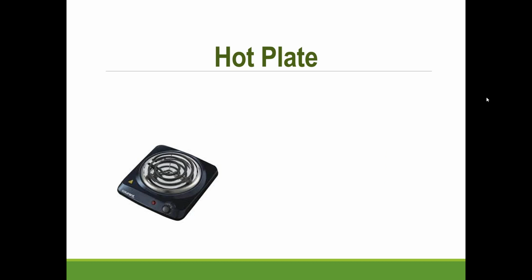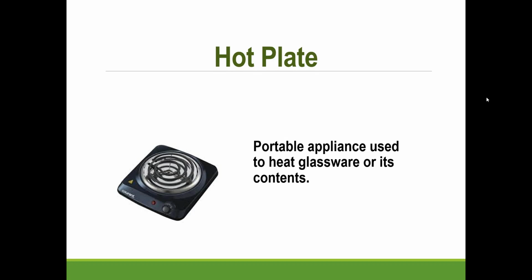This is a hot plate. They look a little different now, but it's almost like a stove, right? A portable appliance used to heat glassware or its contents. If you're heating up something, it's basically like a portable stove. Okay, that's the end of our lesson.